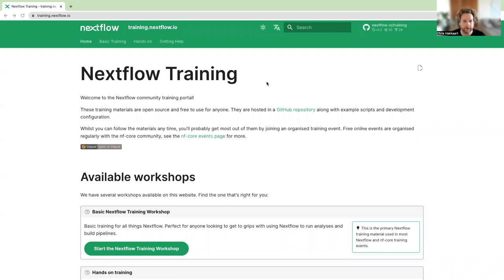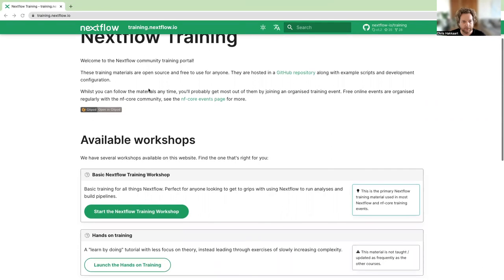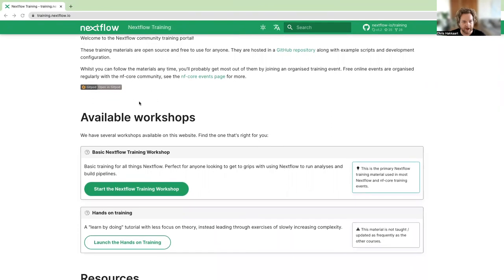Here we are on the Nextflow training website at training.nextflow.io. I'd like everyone to scroll halfway down the page to the list of available workshops. We'll be using the basic Nextflow training workshop content, which you can access by clicking the green button that says 'Start the Nextflow Training Workshop'.